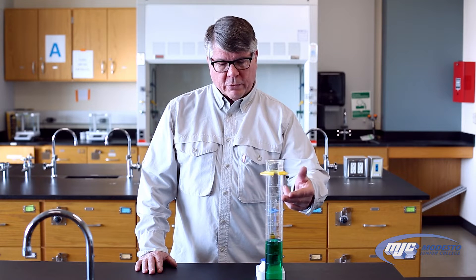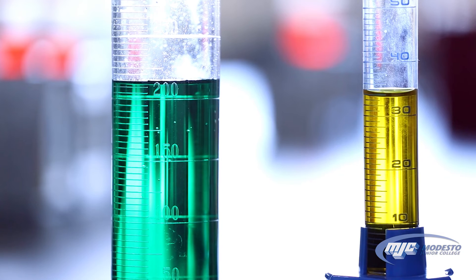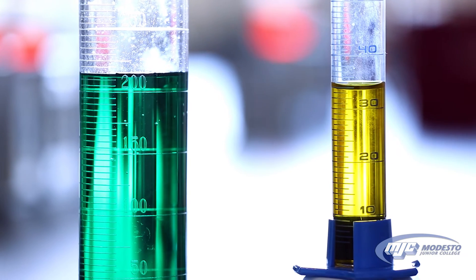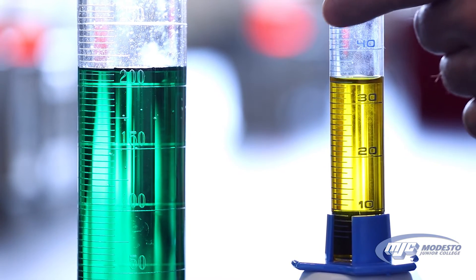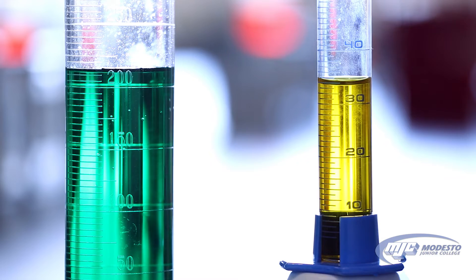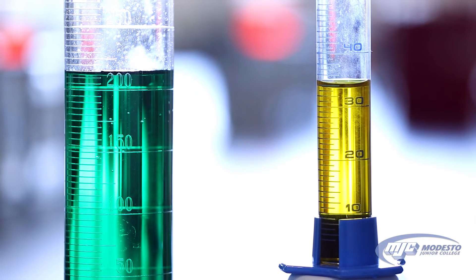For example, with this graduated cylinder here, the closest marks are five milliliters apart, so that means we can estimate to the ones place, but we cannot read this to the tenth place — it's impossible. Whereas this graduated cylinder here, the smaller one, the closest marks are one milliliter apart, which means we can estimate to the tenth place but no farther.